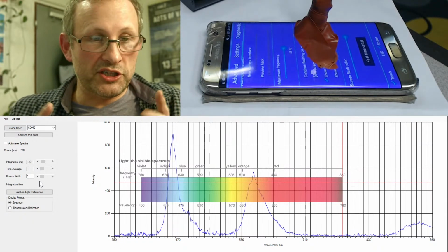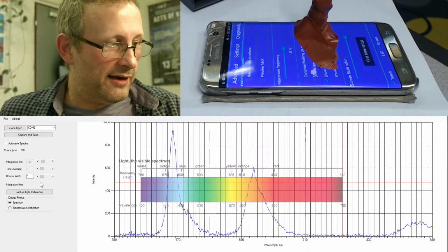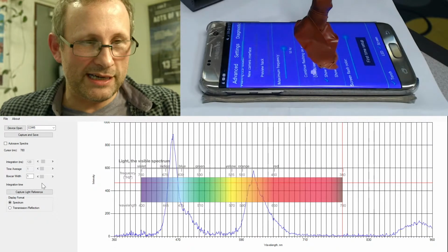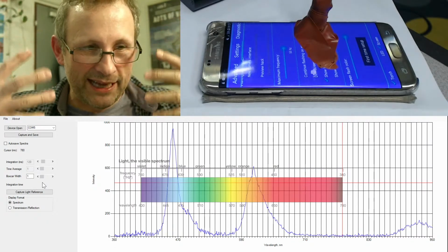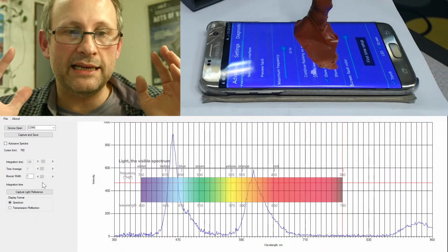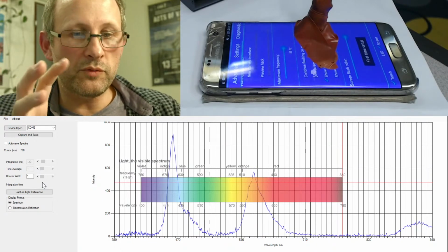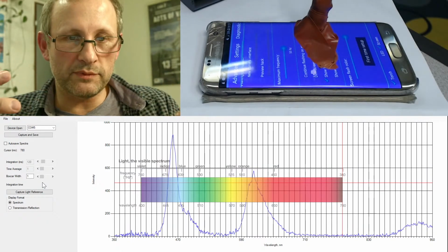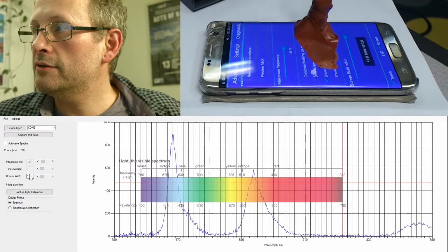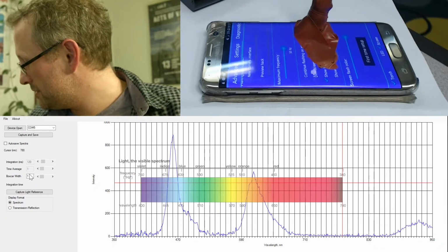And the beauty of this, just as I am showing you right here, this window where I am showing this device, this could actually be a video of the reactor, and where my ugly mugshot is here, this bit here, this could be other data panels in the live recording of the experiment. And so you can already see how we can share multiple pieces of data in the same frame and have it all synced together. So are there any questions? I think that's all I want to say tonight, really, unless you've got some other questions.